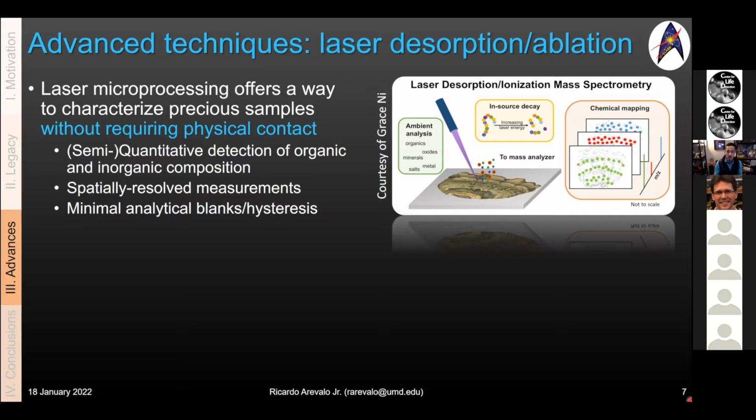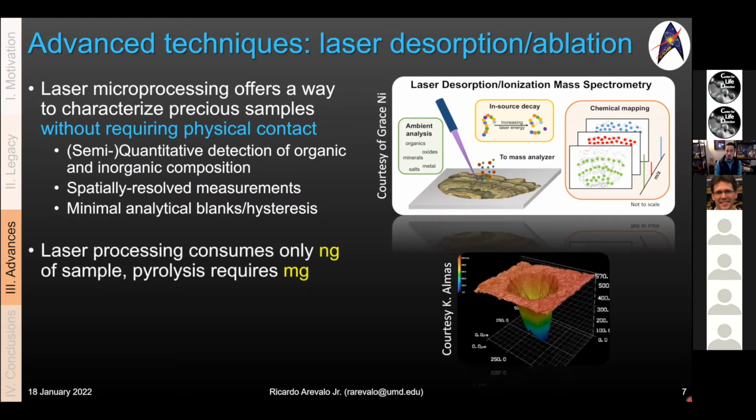And because it's a microbeam technique, you get spatially resolved measurements, with the spatial resolution being limited primarily by the footprint of your laser beam at the sample of the surface that you're trying to characterize. On top of that, laser desorption and laser ablation techniques are destructive, but they're far less destructive than some of the techniques that we've flown to date.